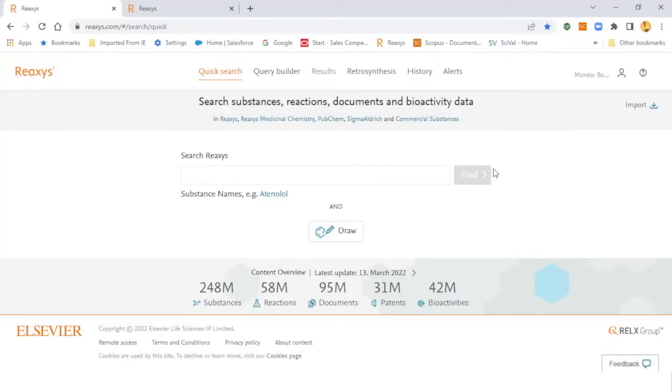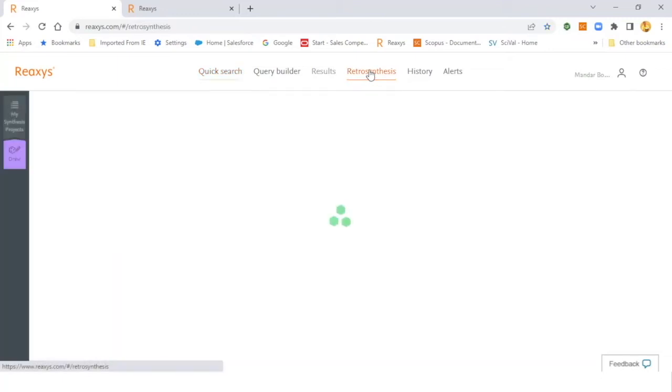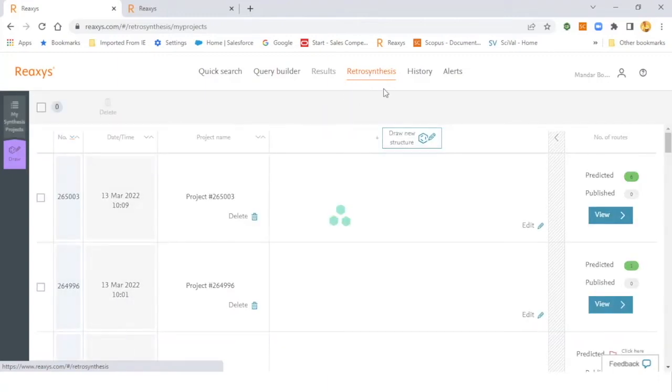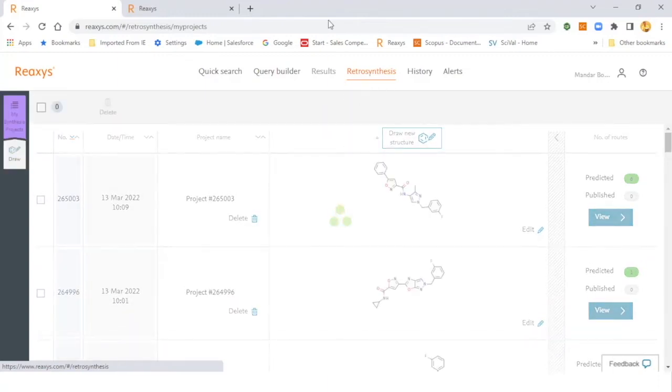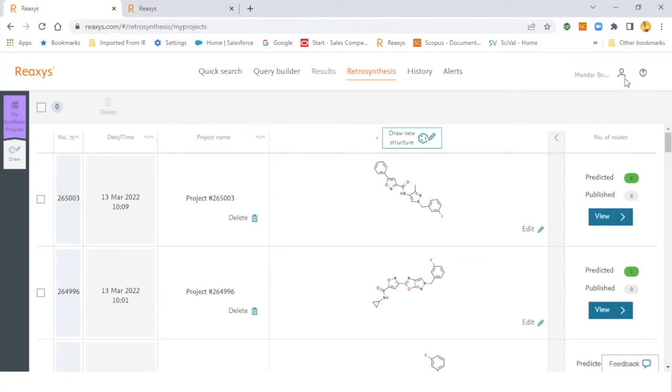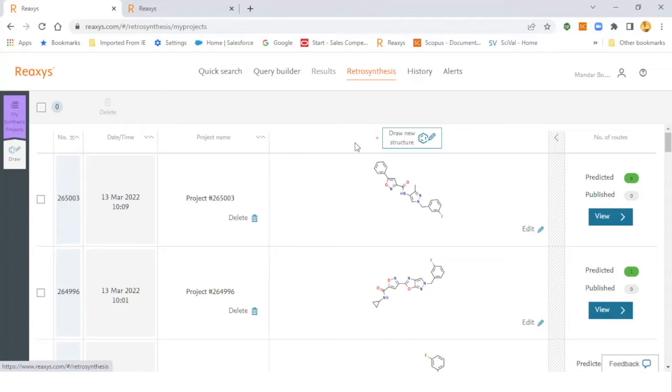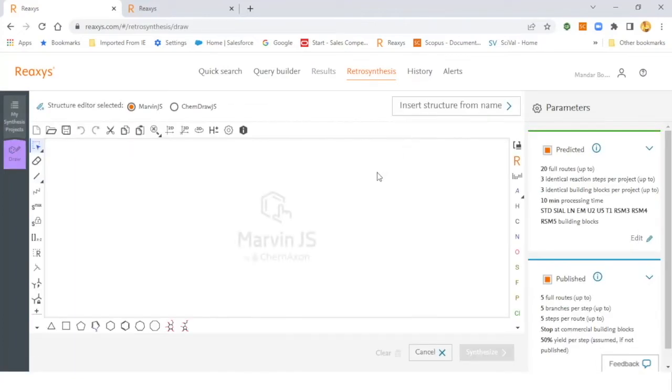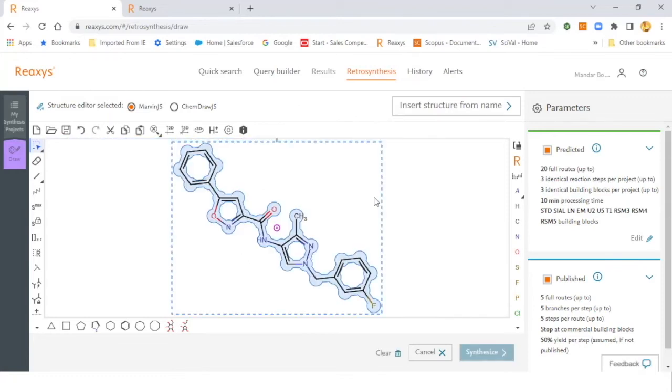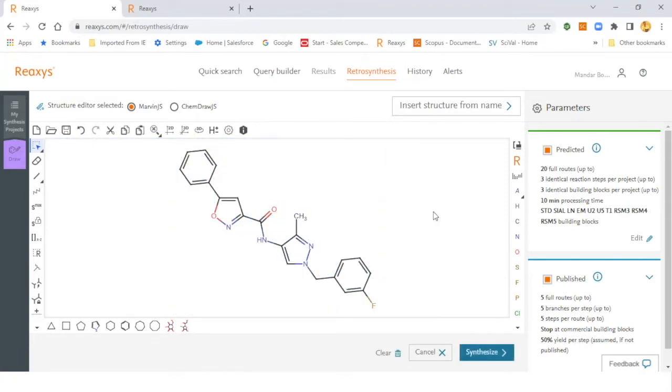Let's go to Reaxys.com to obtain synthetic routes. Once you are in Reaxys.com, you have to hit the Retrosynthesis tab. Once we are in the Retrosynthesis tab, you will see the landing page of the respective users. As I have logged in with my name, you will see all the projects under my name and it is specific to the user only. Then you can click the Draw button and copy paste SMILES directly into the structure window. Once you have the structure in place, you can play around with the various parameters in the predicted section.